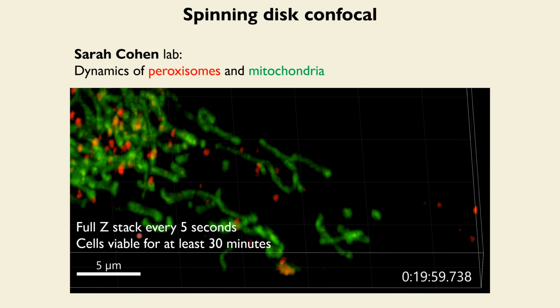Let me run that again. Okay, it's not going to run again. You can scroll back in the video if you want. There are all sorts of interesting behaviors you can see in that video: mitochondria fusing, splitting apart, peroxisomes wandering around near them, et cetera, et cetera.